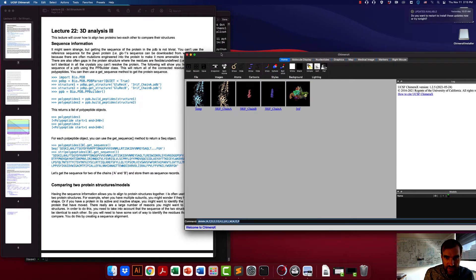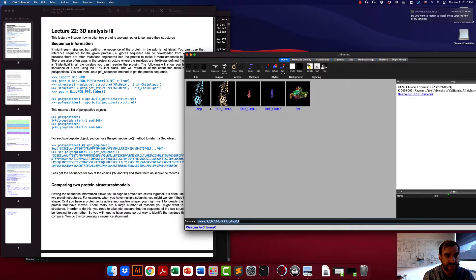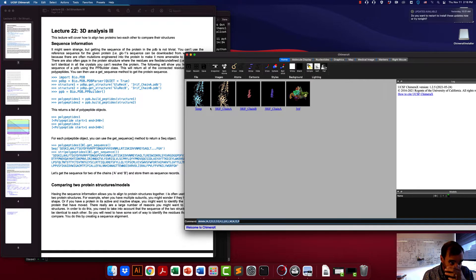For the final part of this, we are going to go over how to align two proteins to each other to compare their structures. You should feel comfortable using Chimera and BioPython in order to start to analyze proteins and find their positions. What we also want to be able to do is compare two proteins and compare how far apart a ligand is to a given amino acid. But let's say you wanted to compare two different structures together.